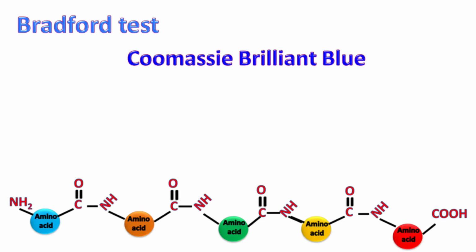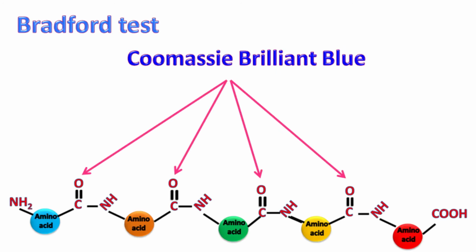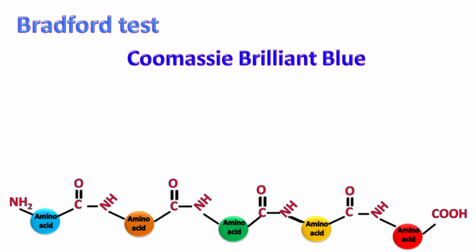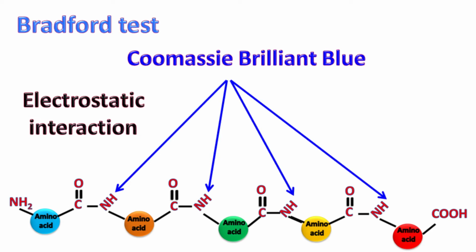The dye reacts with the carboxyl group of protein via van der Waals interaction, while the dye reacts with the amino group via electrostatic interaction.